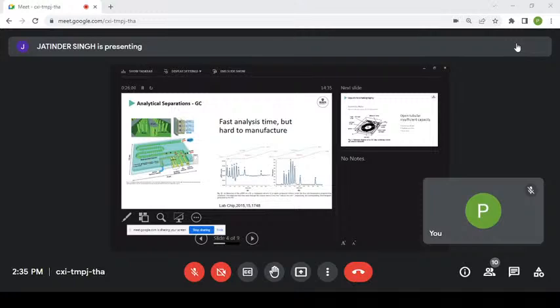This detector is not quite as sensitive as that one. It's miniaturized, it's fabricated. Can't expect everything, but very comparable separation. We can see the same analytes, we can quantify the same analytes, but here we've done it on a microfluidic device doing gas chromatography and not with an instrument that's sitting on the bench.